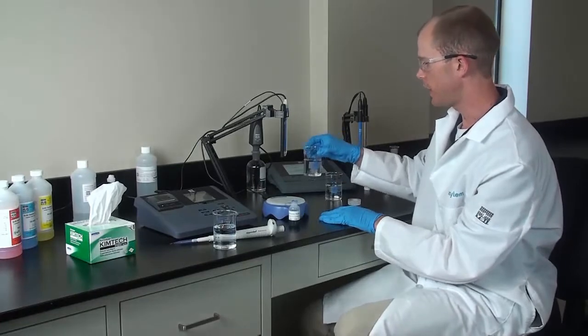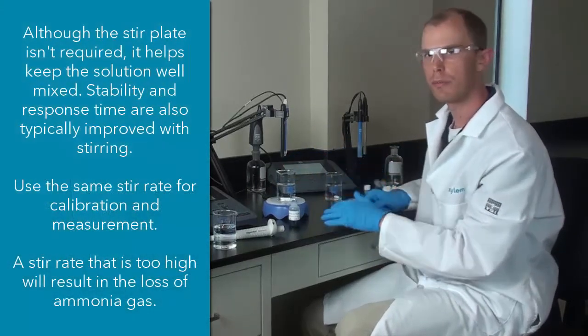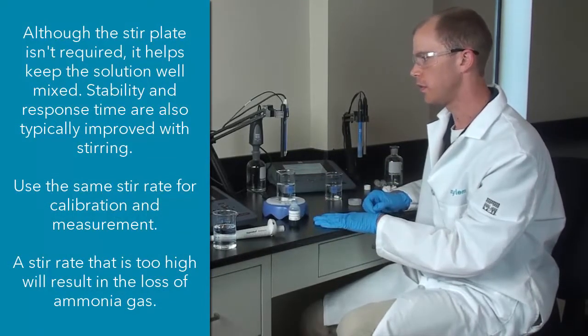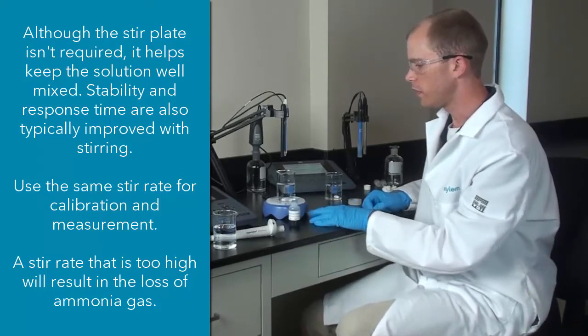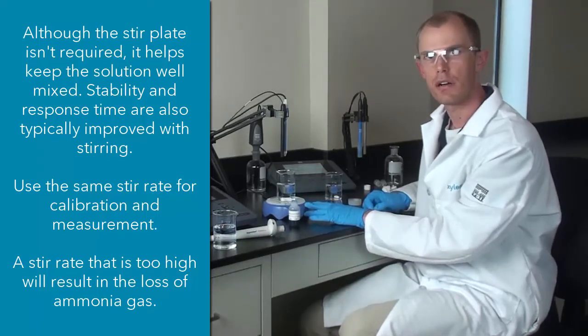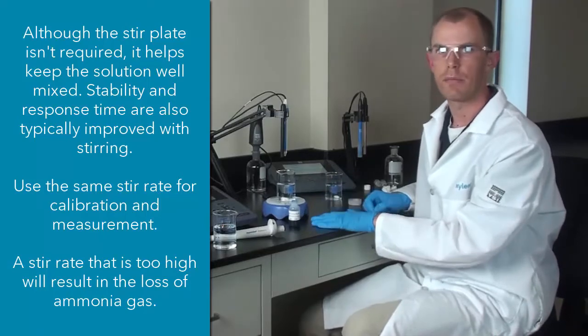So then we will place our 10 mg per liter standard on a stir plate, and you will always want to make sure that your samples are well mixed. So it is best to use a stir plate whether you are calibrating ammonia or nitrate or any other ISE. So you don't need to have a high RPM setting on your stir plate just because it is going to cause your ammonia to escape faster.